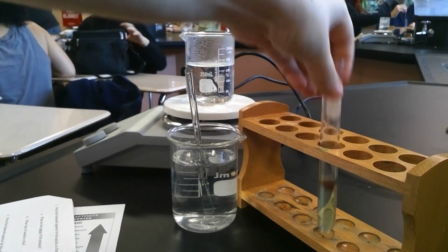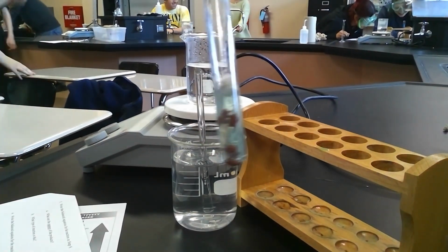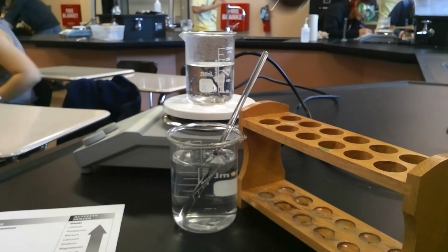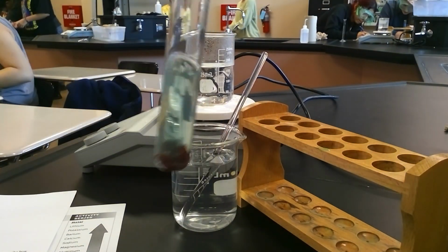Alright, so checking on the product again. If I continue to tap this, the aluminum foil has completely changed into this kind of rust red color. So I no longer have any silver foil left. I have only this, which is my copper product. So just copper at the end, which tells me that my aluminum chloride, plus everything else that was in here, is kind of like a light bluish, clearish color, and then my copper is what the reddish solid is at the end.